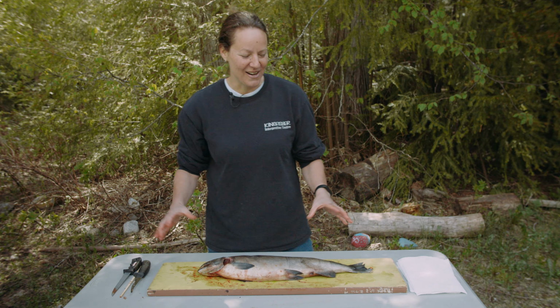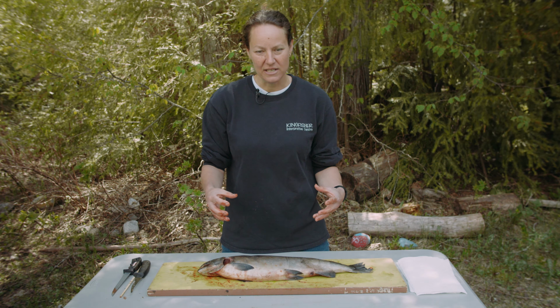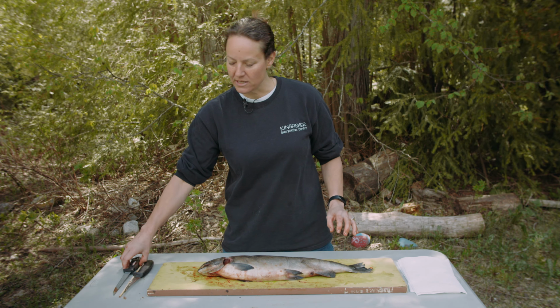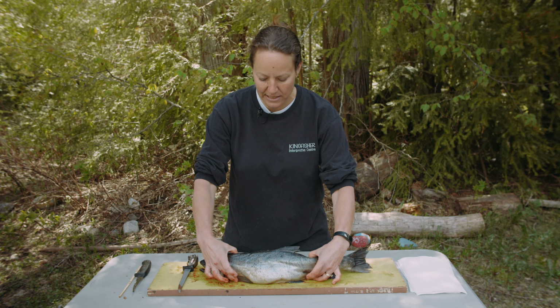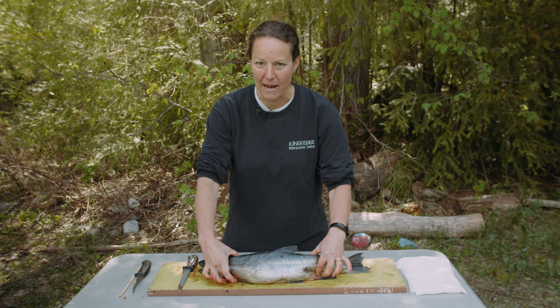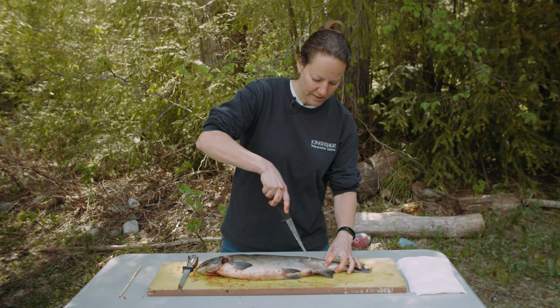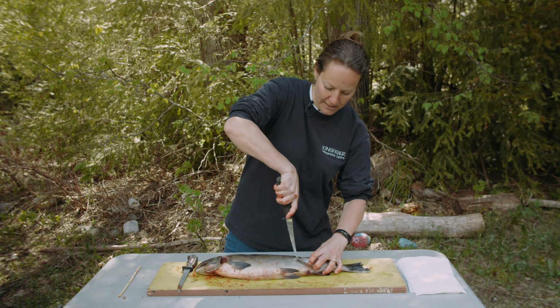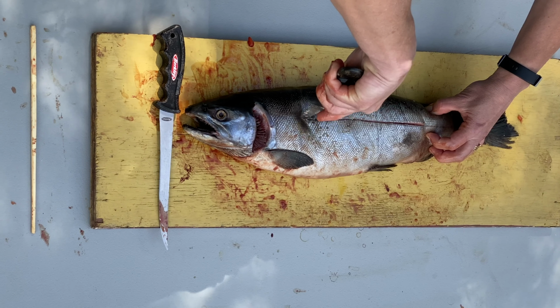So, boys and girls, here is our girl fish. Now, in order to look inside this fish, we're going to cut a window into it. And the window starts along the lateral line. Remember where that lateral line is? There it is, right there. Behind that lateral line is the backbone. So that's what we're trying to find. So here we go. So we'll make a little incision here. And then we slice along the lateral line all the way up the fish.